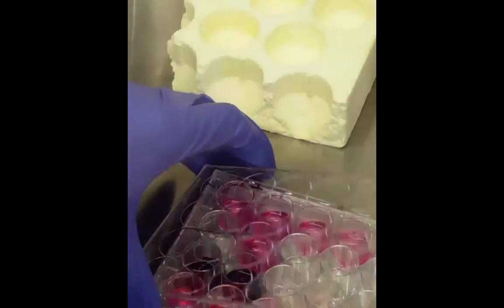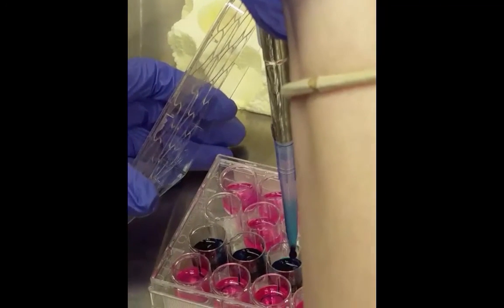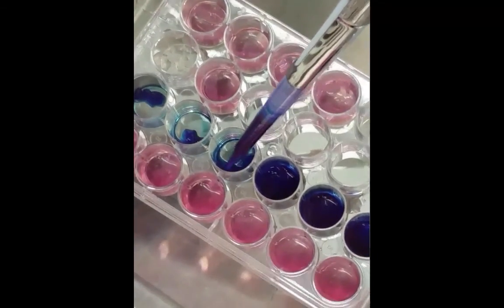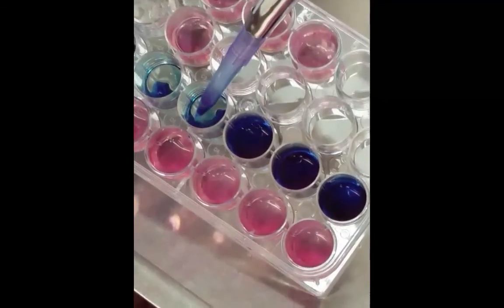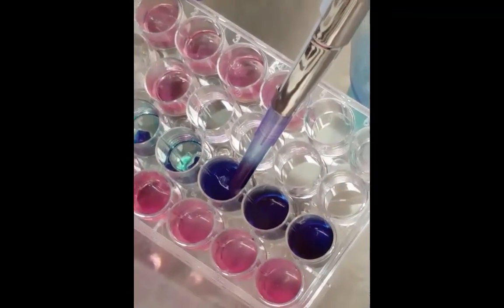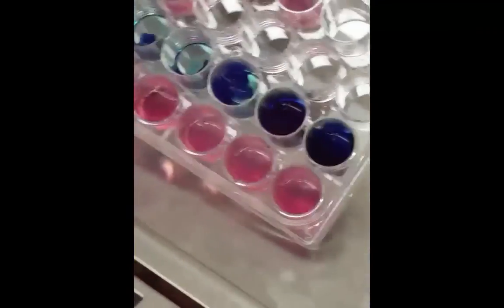Now you'll leave this stain over the gels for 30 minutes, incubating at room temperature, so leave the lid on the well plate and leave it in the hood once you're done. And after 30 minutes, you will remove the Alcian blue stain from around the alginate gels. And we really don't want excess stain in the well, so try as best as you can to remove all the excess liquid from around the gel, dumping it into the liquid waste. You may notice that the gels have shrunk a little bit, which is normal.